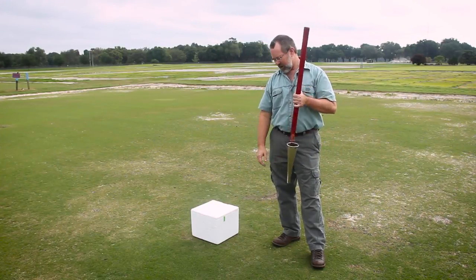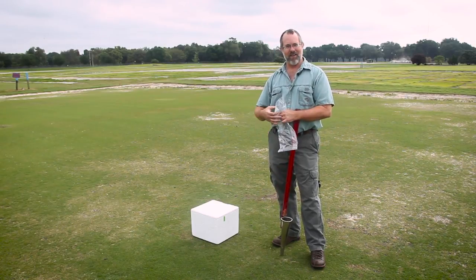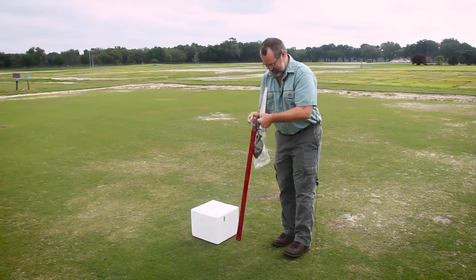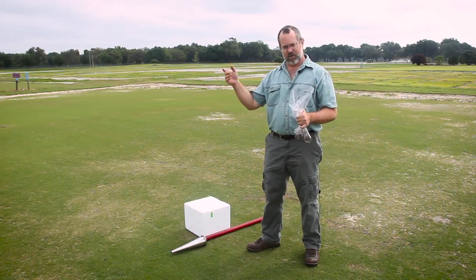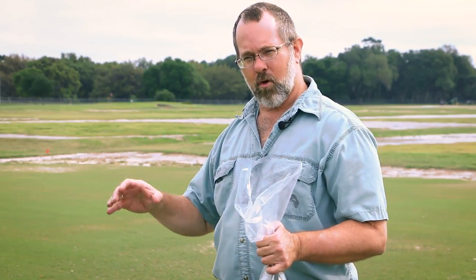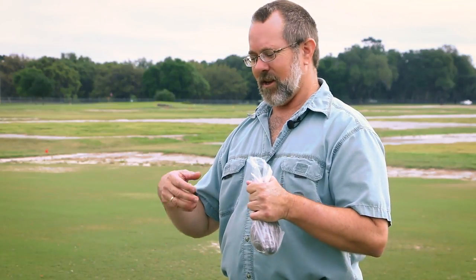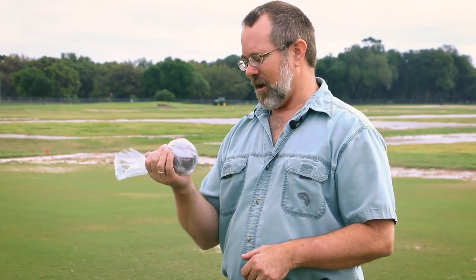Once we get our sample, the next important thing is to put it in a bag. I highly advise that you use plastic bags and not paper bags or soil test bags. We want to keep them in a plastic bag so they don't dry out. Generally, we want you to take cores from about 16 spots around the area — whether you're sampling a fairway, a tee, or a green — about 16 cores, three to four inches deep. Seal the bag up and it's ready to go. You can use Ziploc bags, bread bags, all kinds of bags. The important thing is it's a plastic bag that you can seal so it's not going to dry out.